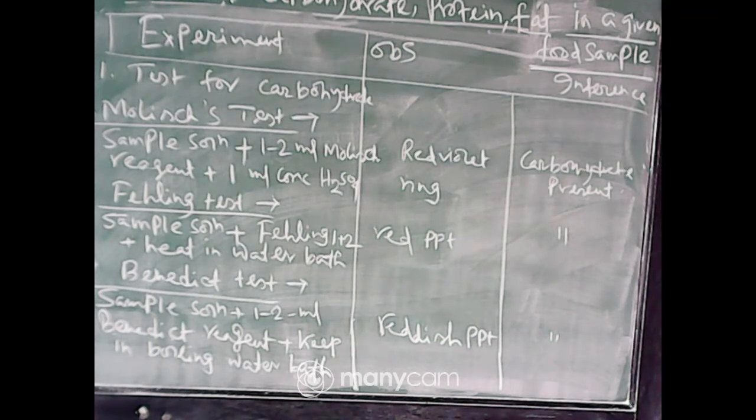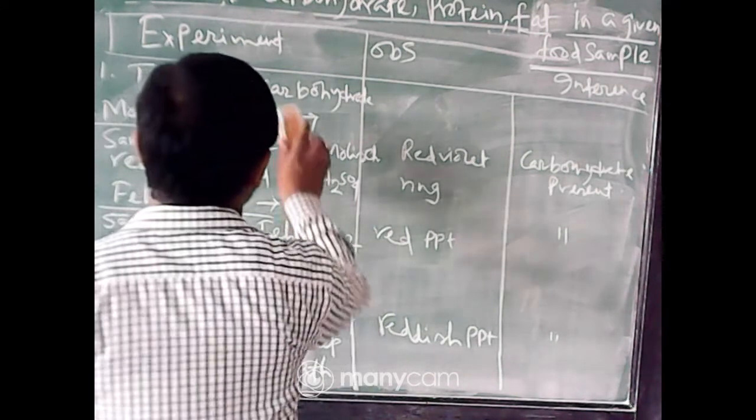Completed. Why are you taking so much time to write just 3 tests? Okay. Now I will go for the next experiment, that is the test for protein.